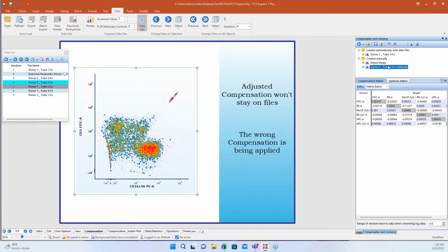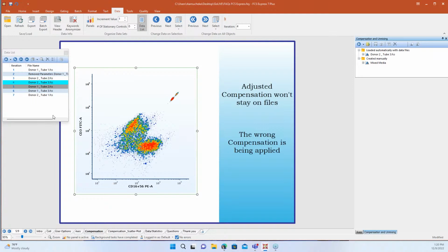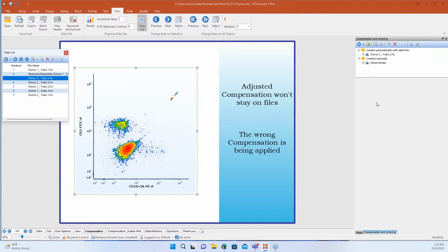it's going to use that compensation that I just created. Yeah, I think an easy way to think about this is, a lot of people think that the only way you're doing a manual compensation is if you calculate compensation using the wizard in FCS Express, right? And that's certainly a manual compensation. But as soon as you take a compensation that came automatically with your data files and you modify it, and there's a number of reasons why you would want to do that, it becomes a manual compensation, right? Because you've manually done something to it. And so if you think about it that way, okay, now I have a manual compensation because I've made a change to my existing comp, so I need to make sure I apply it the same way I would do a manual compensation.